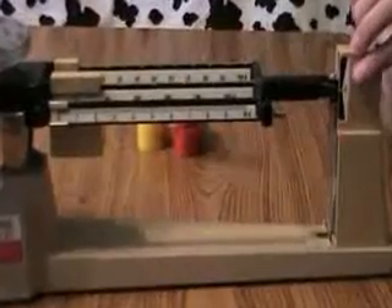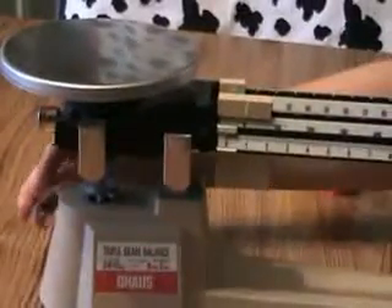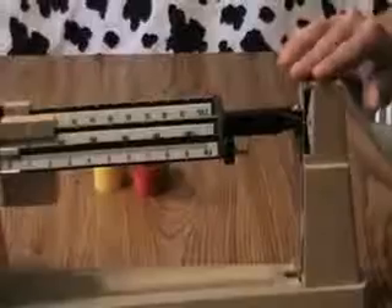If for some reason it does not line up and all your weights are moved over, you can reach over to the knob back here called the zero adjust knob and either move it clockwise or counterclockwise to adjust your line so it lines up. Once everything's lined up, you're ready to start measuring.